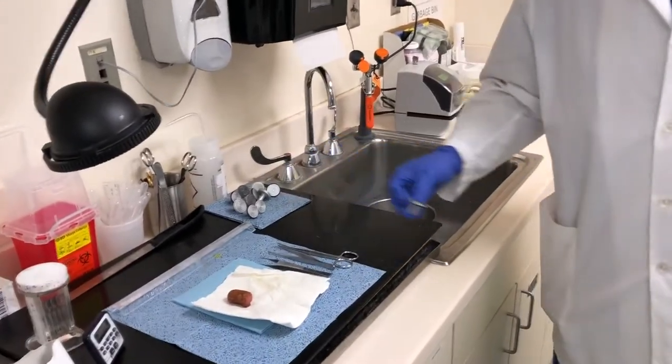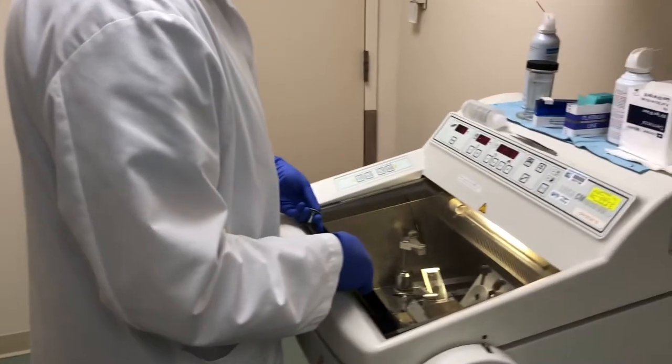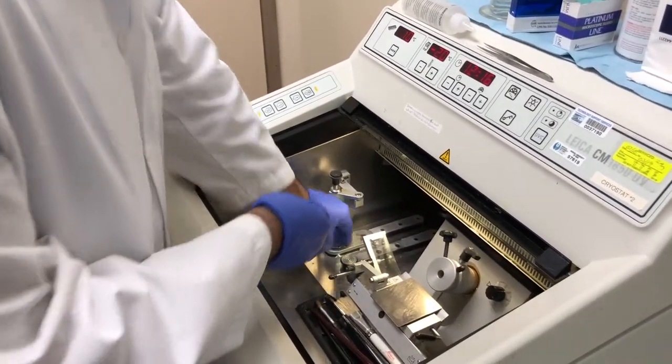Grab a few chucks, which are small pieces of steel that you will be embedding the tissue in. Put the chucks in the cryostat, which will then be cooled to approximately negative 20 to negative 30 degrees Celsius.